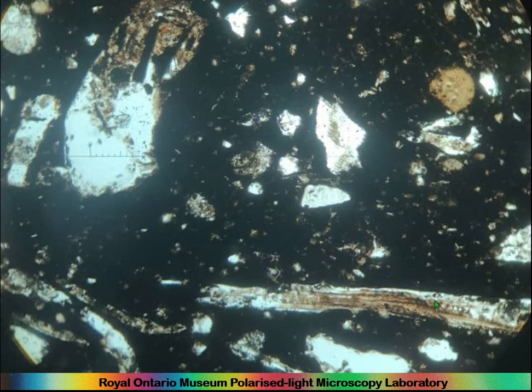It looks like a nice big bit, and it seems to have finite ends. It's possible that this is something like chopped straw or something. Here's another bit. Most of these inclusions look like they were probably plant fibers, and these voids, shall we say.